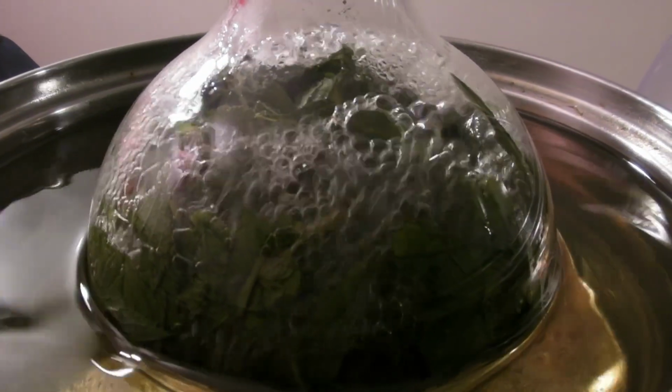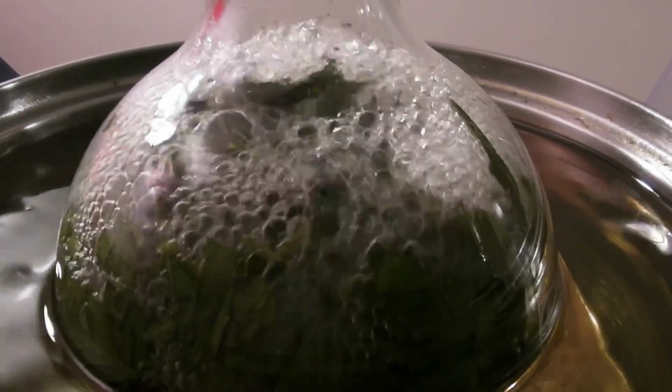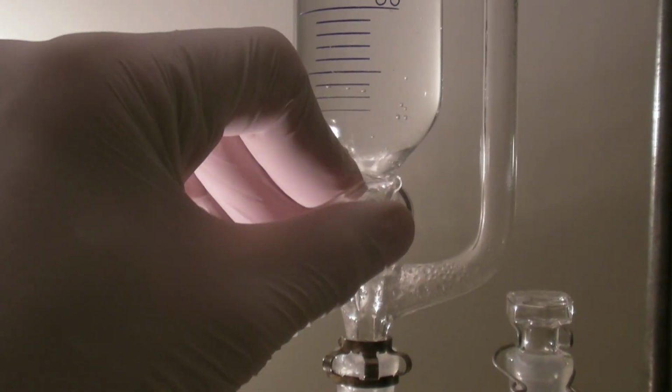Many of the other compounds in essential oils quite often decompose at lower temperatures, which is why they are very often obtained via a steam distillation. Due to the leaves not being cut too small, the steam can distribute evenly between them. When the oil bath becomes too hot, the foam can rise too much. By adding water and decreasing the temperature, it can be prevented from foaming over.